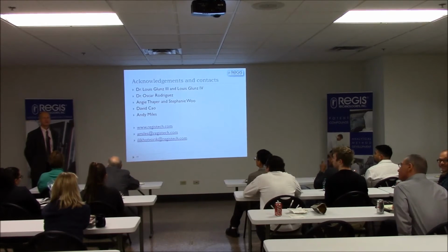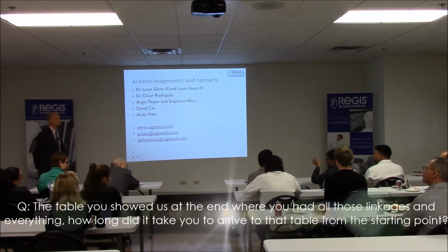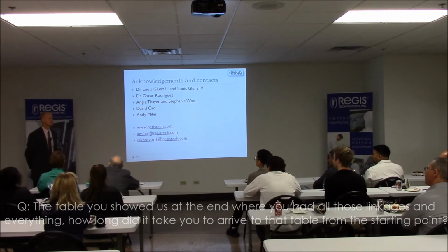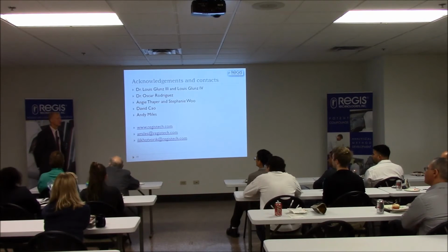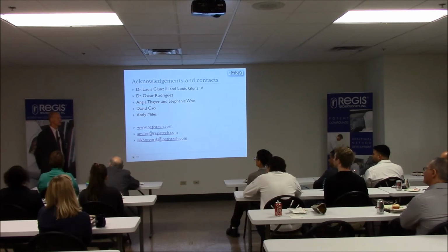Any other questions? Yeah, I just have one last question. The table you showed us at the end, where you had all those linkages and everything, how long did it take you to arrive at that table from the starting point? Well, you have to analyze your spectral data. Obviously, as I mentioned, collecting the spectral data would take probably half a day, NMR data, both one-dimensional and two-dimensional. And then it depends how complicated your structure is.